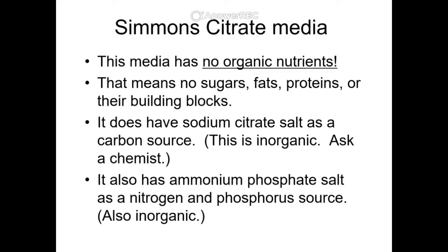Okay, next we have Simmons Citrate media. This media has no organic nutrients. That means it doesn't have sugars, fats, proteins, or their building blocks. It does, however, have a sodium citrate salt as a carbon source, and this is considered inorganic. I believe it has to do with how oxidized that carbon is, but if you want further details on what makes a carbon source organic, you might have to speak to a chemist.